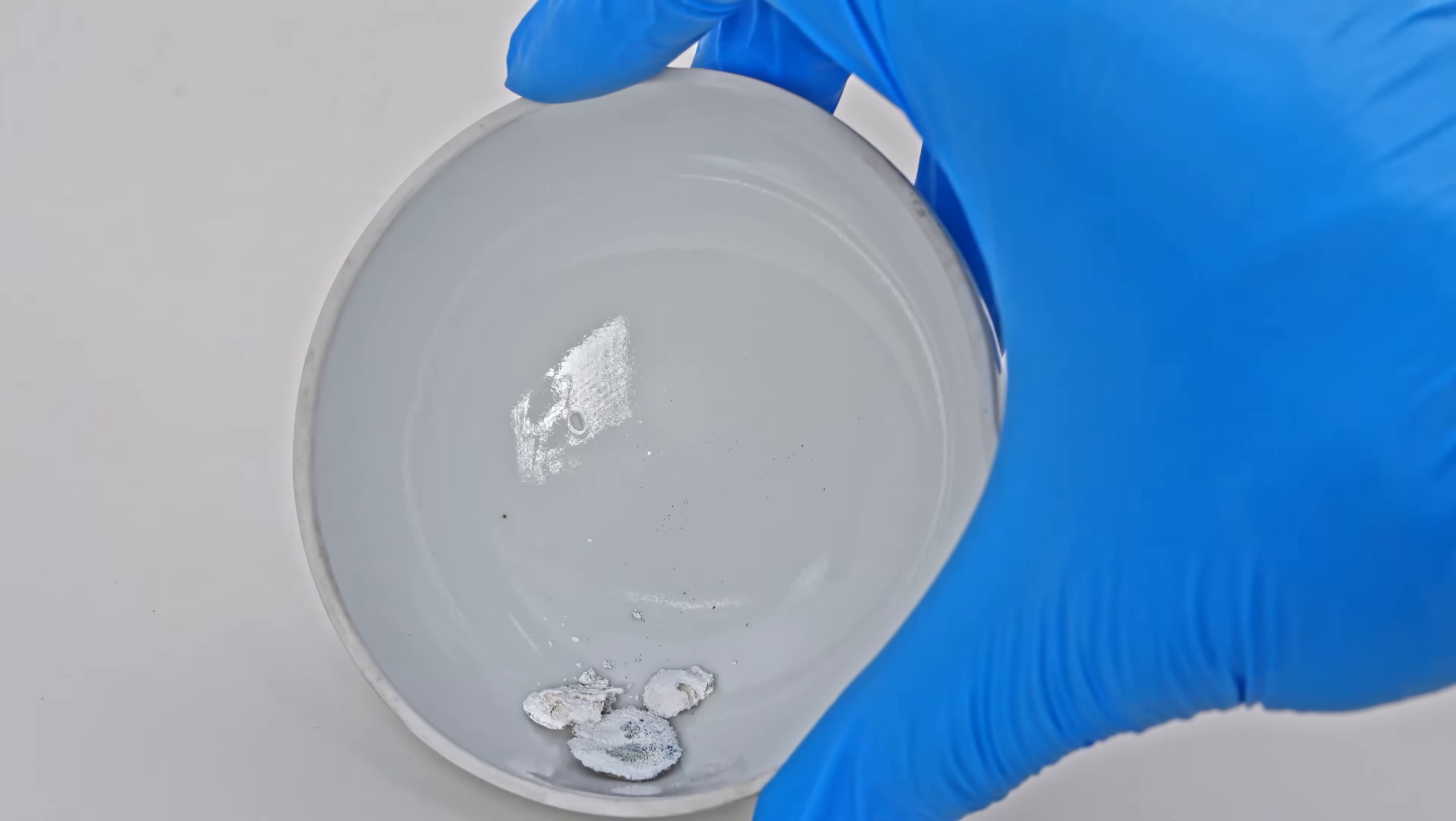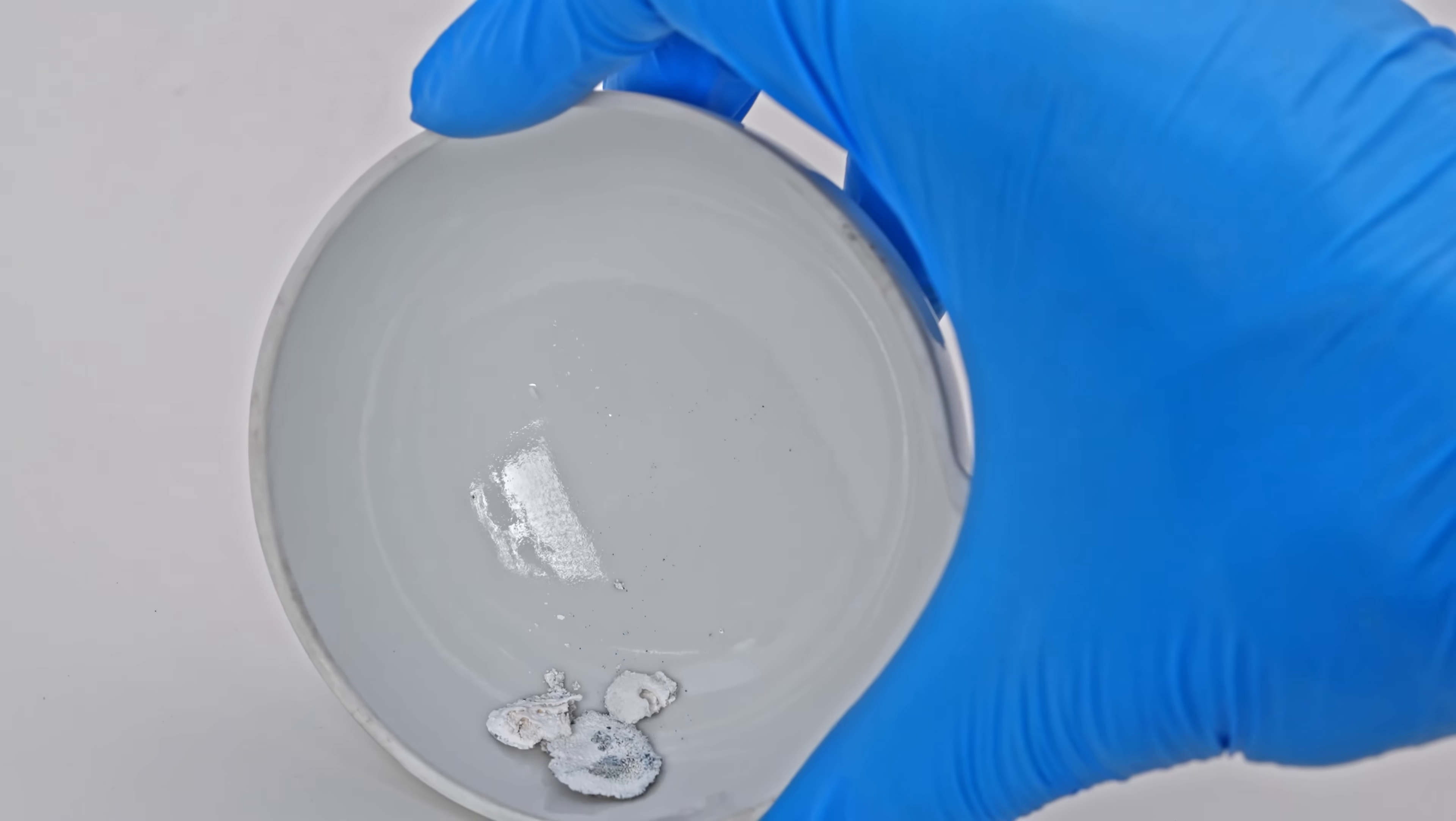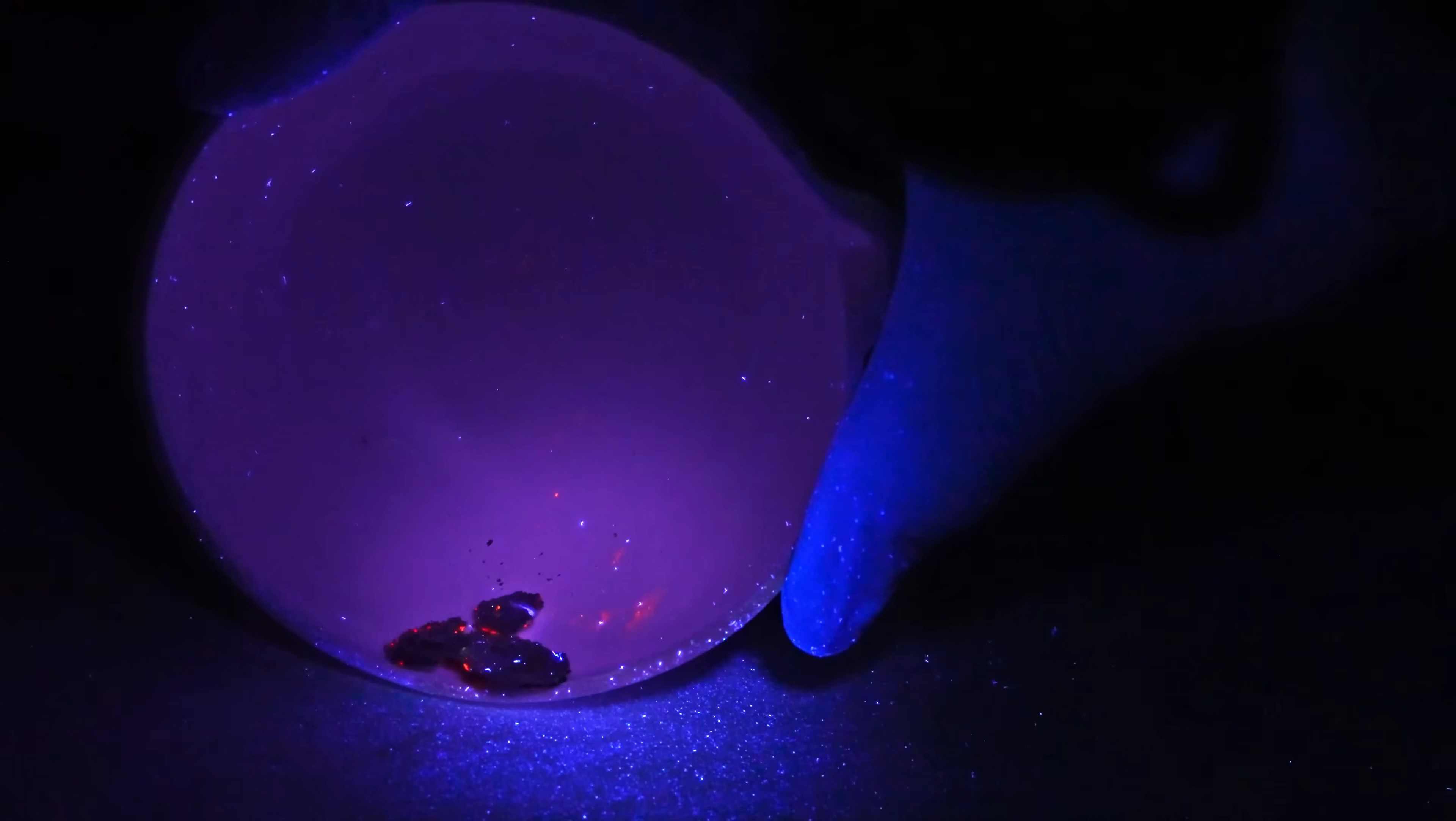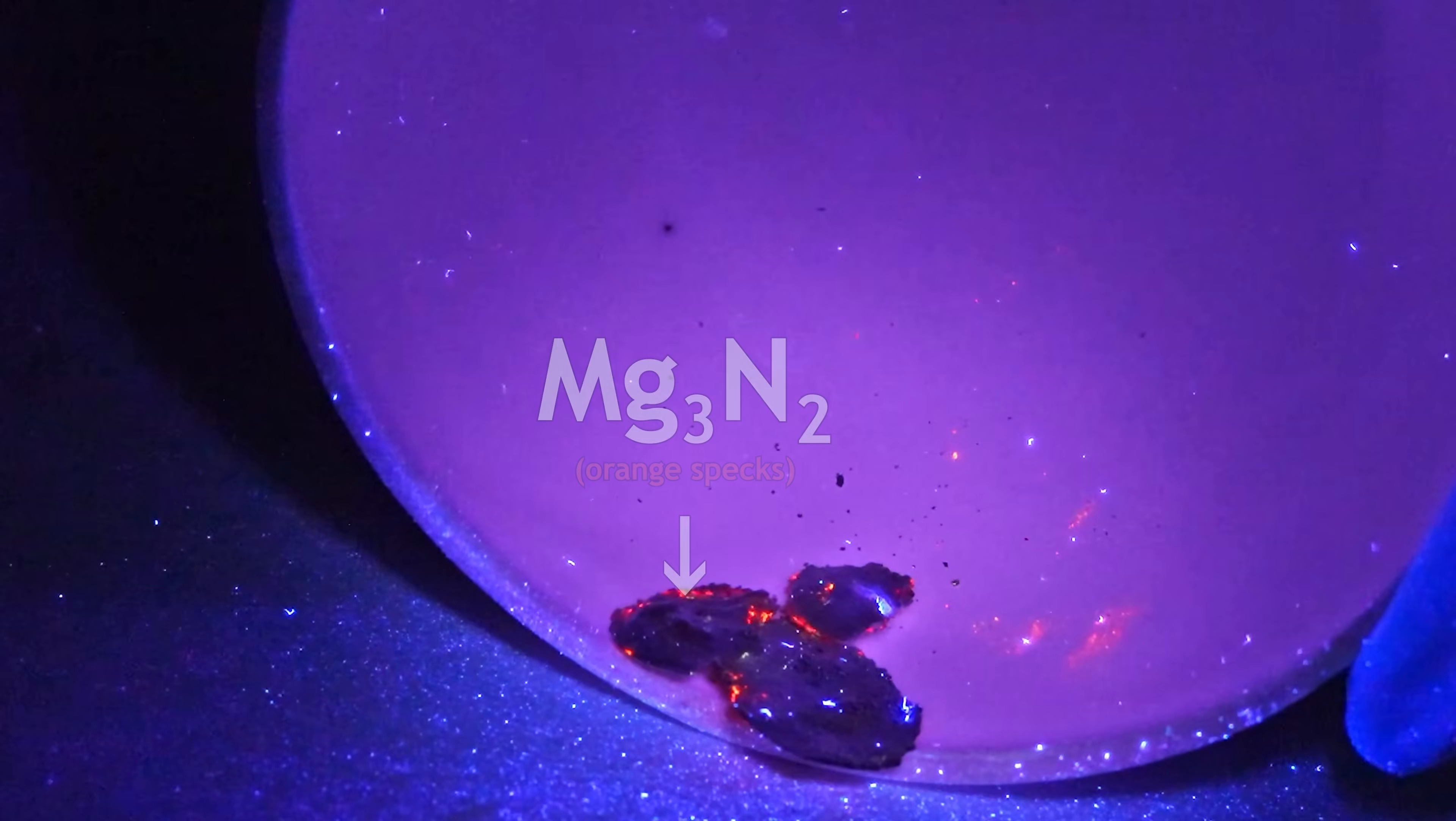But what happens if we look at this powder under ultraviolet light? You can see orange specks, which are magnesium nitride, formed during the burning of magnesium in air due to its reaction with nitrogen.